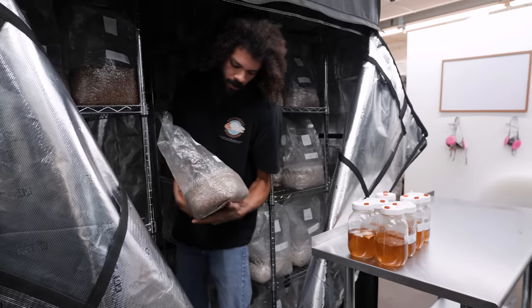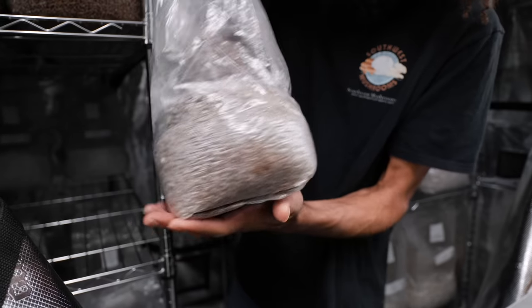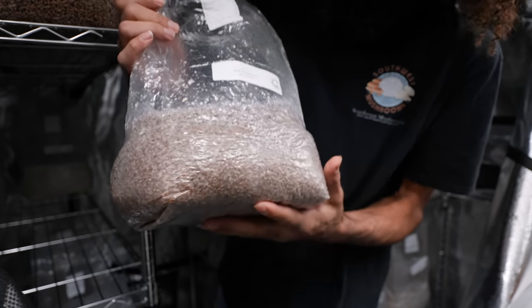Kind of like this bag right here — this one was just shaken up the last couple of days, and now we've basically reached full colonization.